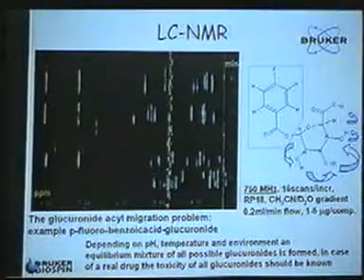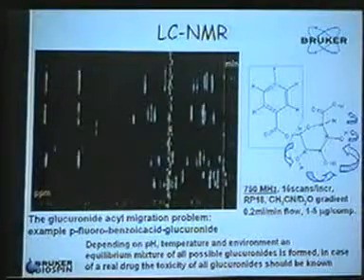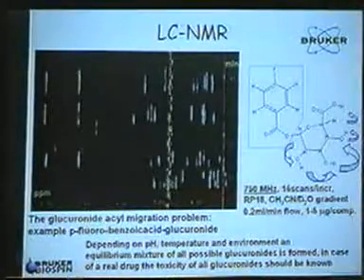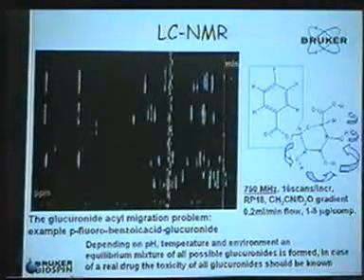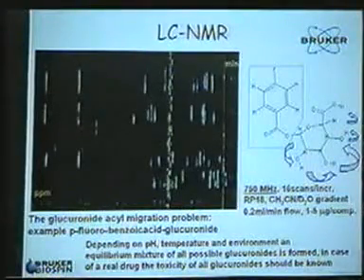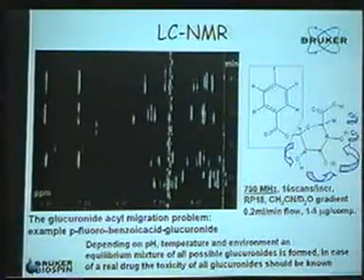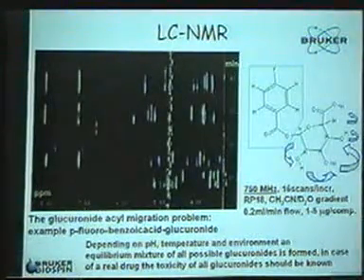And you see it from an NMR point of view, and you know that NMR is quantitative. This is new for LC, because if you do a UV chromatogram, this is not quantitative, because the response of UV depends on the number of chromophore groups that you have on your molecule. The more chromophore groups you have, the bigger UV peak you'll have, and the fewer chromophore groups, the smaller. You might even have no peak if you have no chromophore. And it happened over the years that we had many surprises during demos because people were coming with mixtures.